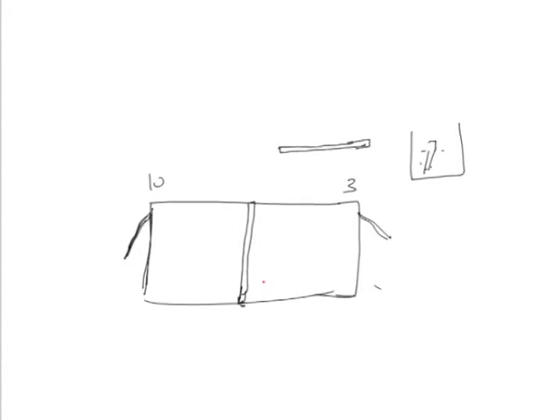There could be other ways. Rather than having this buffer strip, you can put simple obstacles on both sides, and load samples in very small amounts. If you want to load more than one sample, there will be slots here.